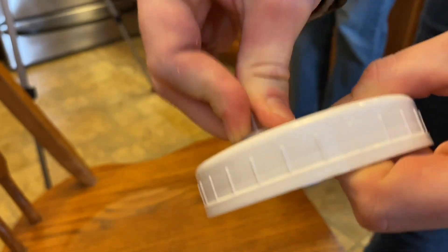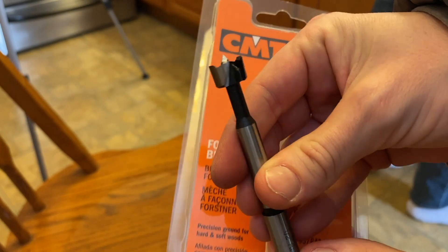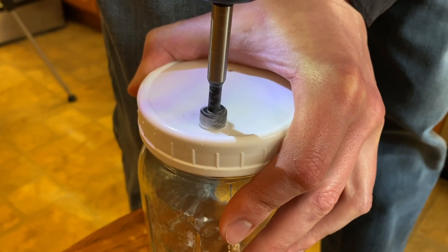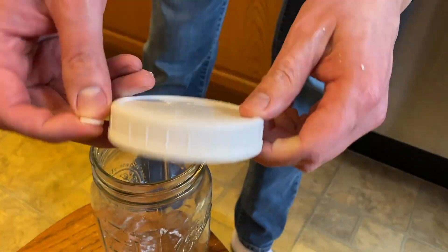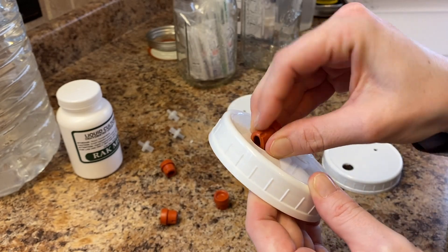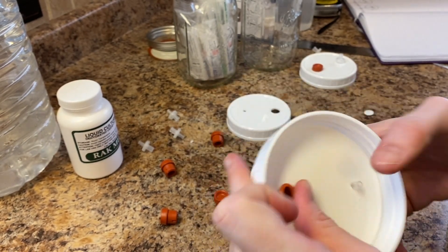Insert the 13mm filter into the hole and it should be a nice snug fit. Then, for the self-healing injection port, I used a half-inch Forstner drill bit. Screw the lid on a mason jar and drill the larger hole for the self-healing injection port. Finally, let's insert the self-healing injection port — just pinch it and try to push it through the hole. From the other side, you can pull with your finger or thumb around the edges and it will just pop into place.